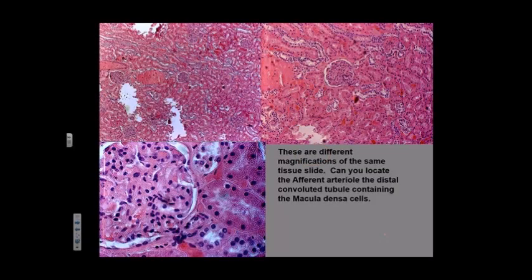We have a lot of tubules in here, and they're both distal convoluted tubules and proximal convoluted tubules mixed in. Now you can tell the difference, okay? So these little small ones right here, that's distal. These foamy ones are proximal. So again, distals, proximals, okay? And of course, here is Bowman's capsule. And it looks like this might be a juxtaglomerular apparatus again. So higher power, the same thing.